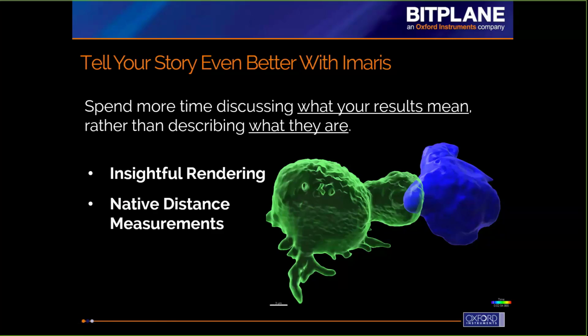The second portion will be talking about these distance measurements that we're making, and we're calling it native because now everything is included inside of Imaris, and it's specifically included within our creation wizards, which is really this place where we find so much of the ease of use of Imaris.